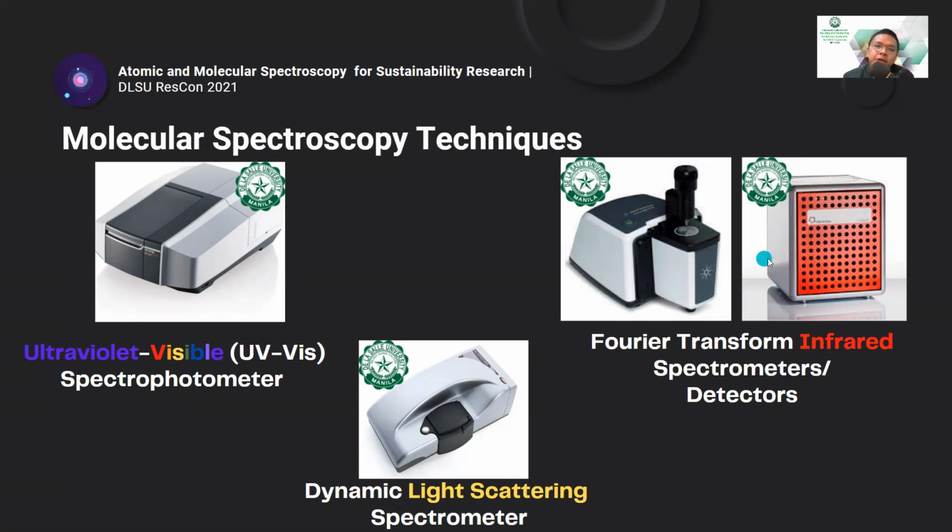And then we also have an elemental analyzer which actually uses chromatography systems in most cases, but it actually has an option for the use of an infrared detector for the analysis of oxygen and sulfur in particular. So yun kaya siya nandito.